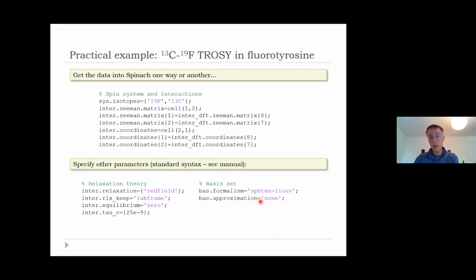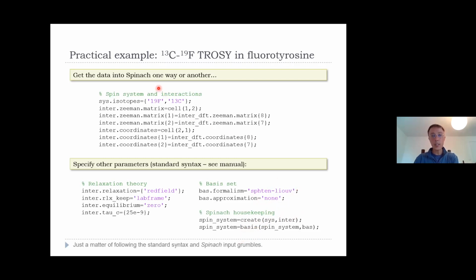Then no approximations, Liouville space, spherical tensors, and we call create, and then we call basis. And it's literally just a meta of, I think it's a quote from Game of Thrones: I've read the book and followed the instructions. So read the wiki, follow the instructions, you'll be fine.